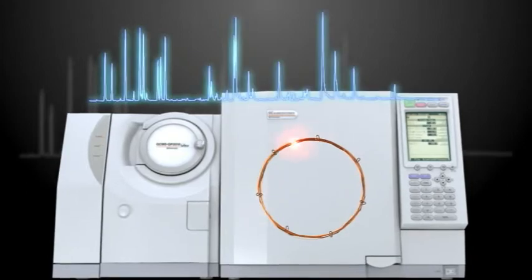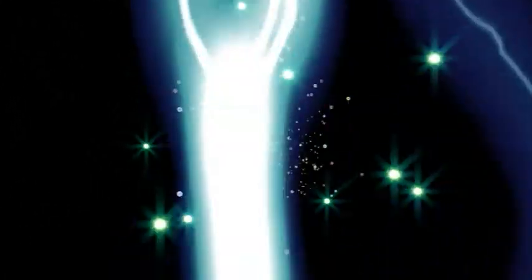With its superior technologies, the QP2010 Ultra is capable of the high-speed data acquisition necessary for quantitation of the ultra-narrow peaks created by fast GC or comprehensive GC by GC.